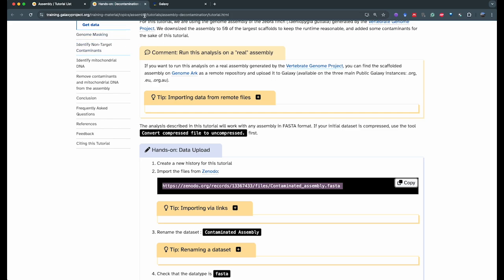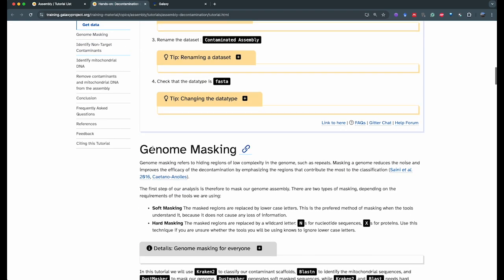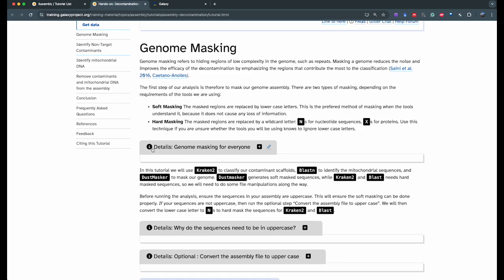We're going to go back to the tutorial and see that the first step is genome masking. Genome masking is a technique that identifies areas in the genome sequence that don't have a lot of identity — it's mostly repeats. These are regions that we don't want the classifier algorithm to focus on because they don't bring information about what species we're looking at. They don't provide a lot of information for classification.